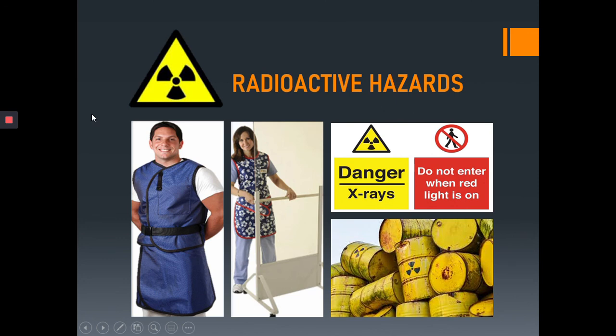Next, we have radioactive hazards. This is not a very common hazard encountered inside the laboratory because we don't usually deal with radioactive chemicals except for immunoserology section, because sometimes they make use of radioactive dyes in detecting certain analyte in the sample, but not all the time. Not all laboratories are designed to deal with radioactive hazards.